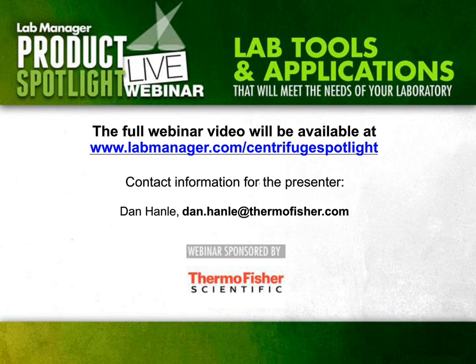Great, thank you. Now, you talked a little bit about servicing a centrifuge there with the O-rings. What other service considerations do you need to look into when you're purchasing a centrifuge?